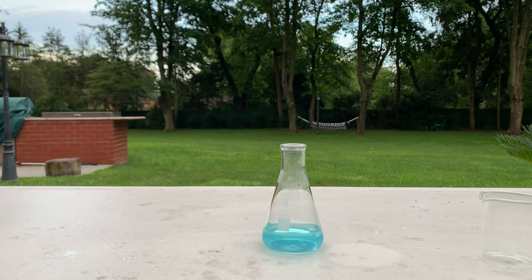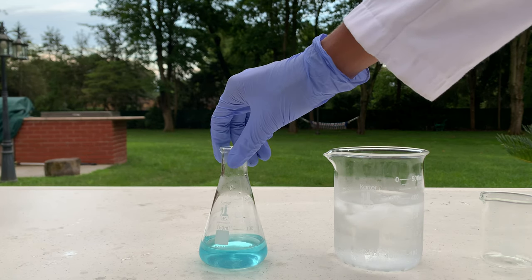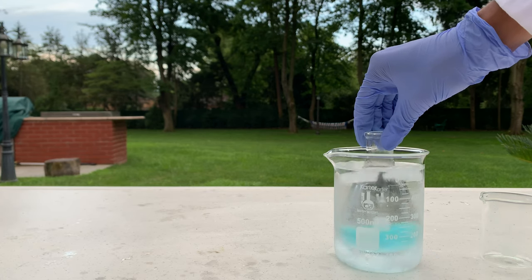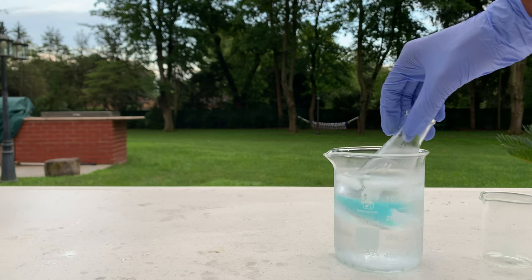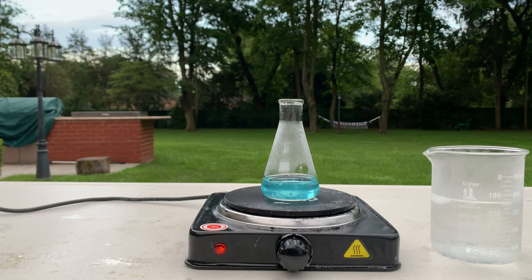Now we're going to try to crystallize this. We're going to see if adding it to an ice bath will cause the copper acetate to crystallize, and let it sit for a bit. After adding it to the ice bath, I wasn't able to get a precipitate, so I'm now going to try to boil it down and see if we can get any crystals from that.